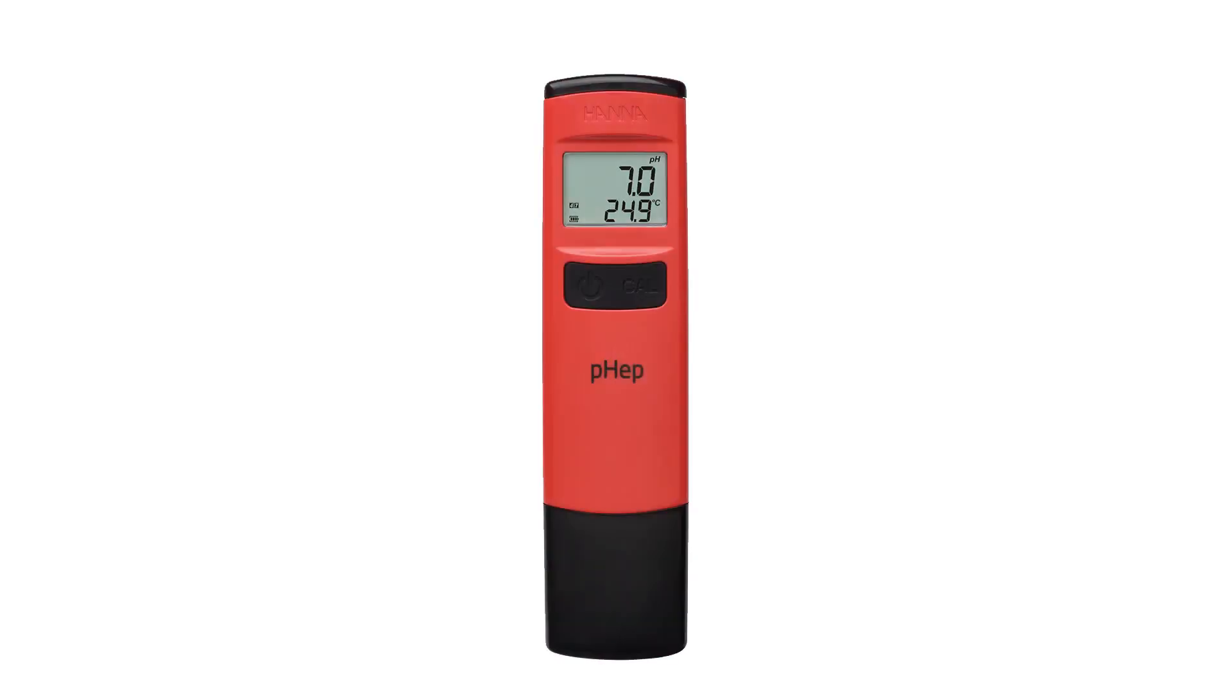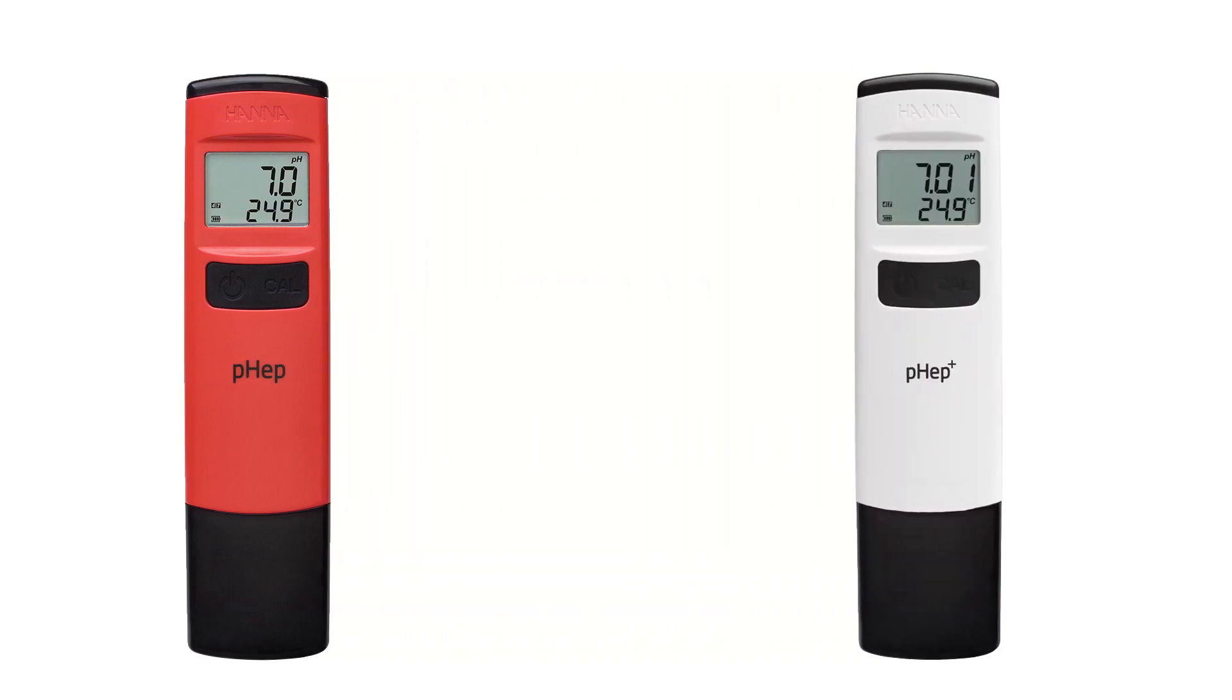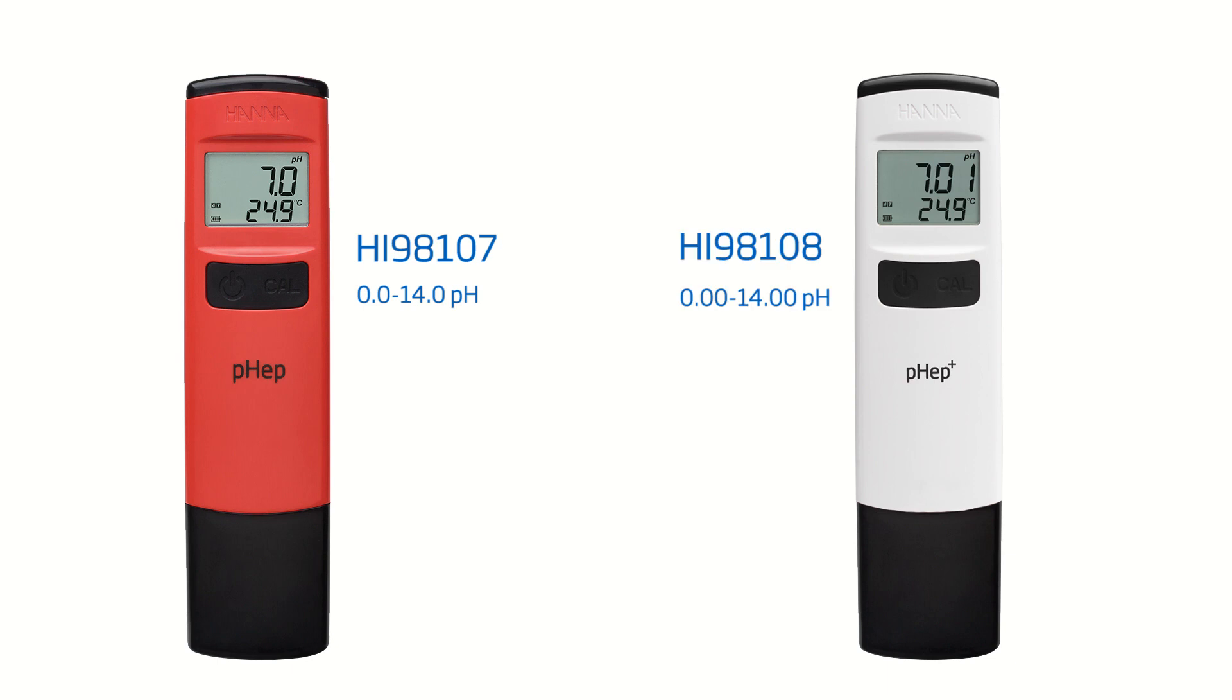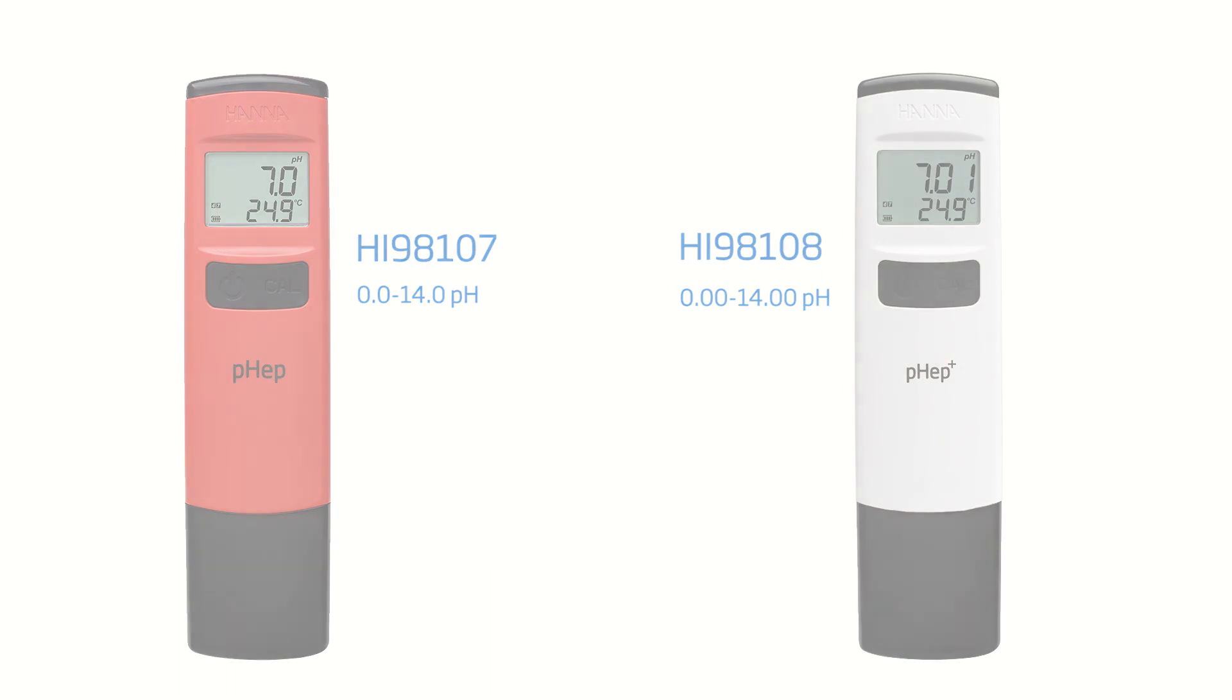Our two most popular meters in the pHep family have been redesigned. They are the HI98107 and the HI98108. Both meters operate in the same fashion, with the only difference being the resolution.